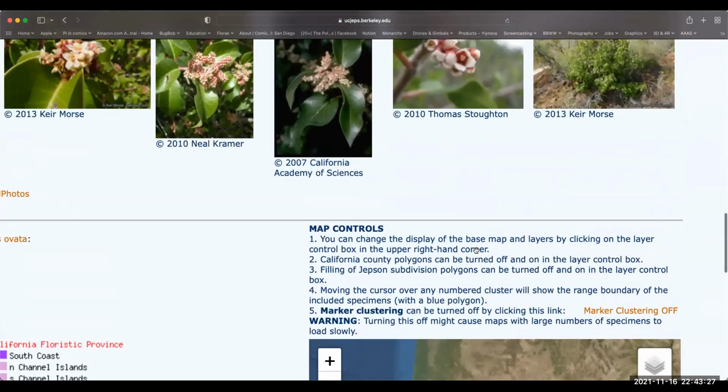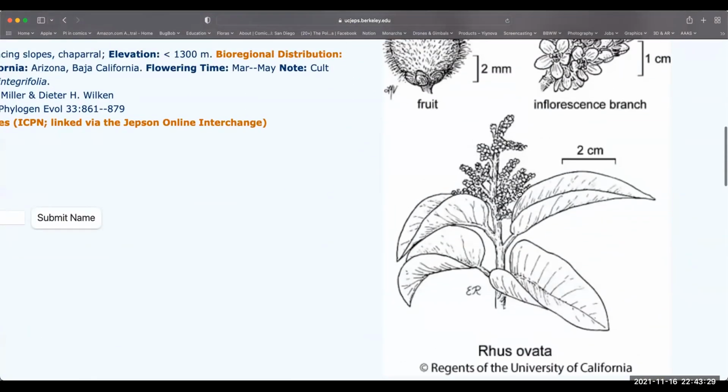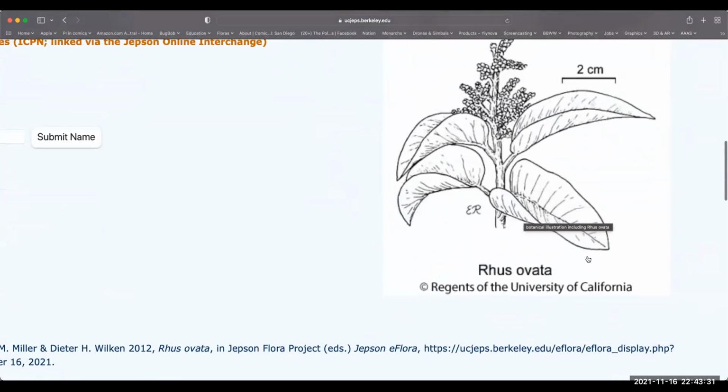And we go back up here and we can see there's the drawing of the leaves. Look for the scientific name, make sure you have the right leaf, the right drawing, and then pick a leaf. Now this plant, there's actually 2 plants that are sometimes called taco plant because the leaves fold up like tacos, which makes me really hungry whenever I see this plant.